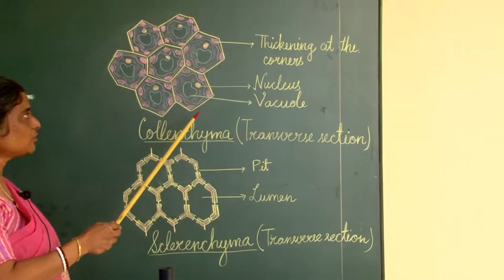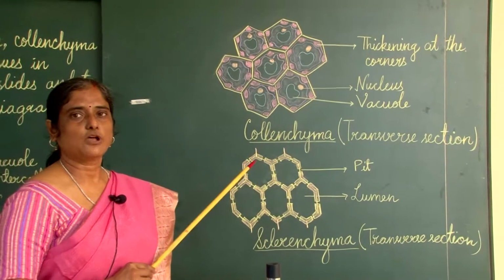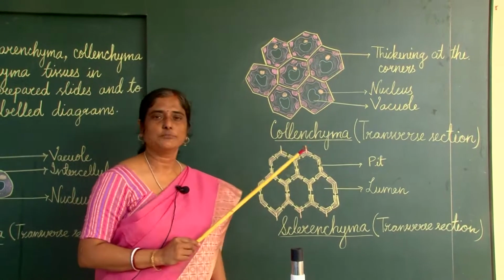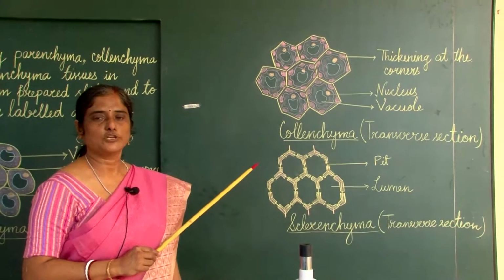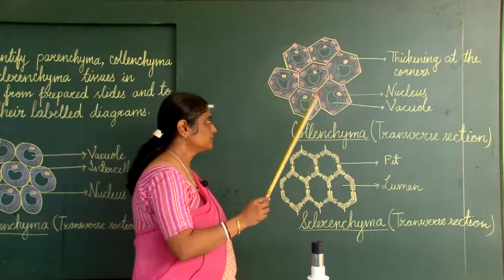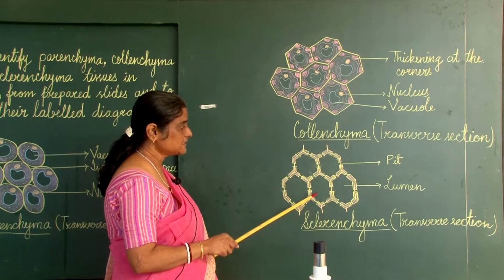Okay. These are also living cells. Where are they found? They are found in the petiole of the leaf or below the epidermis, such as in the hypodermis of the collenchymatous cells of the dicot plants. The third kind of cells, they are the sclerenchyma cells.